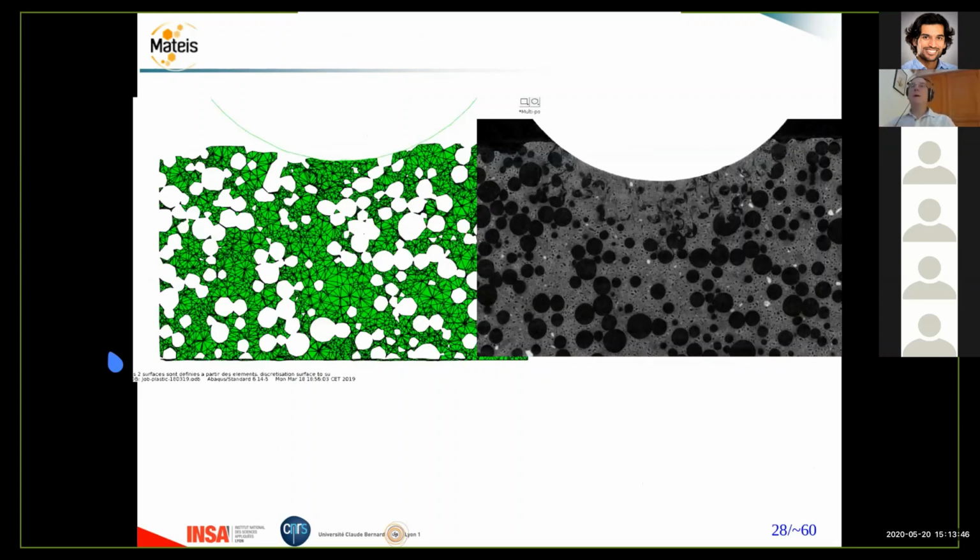As you can see here, the air bubbles are not meshed, so they are like air. But again, you have to remember that all this is porous. So the air bubbles cannot contain air that cannot flow away from the air bubble. So the air bubble is really like a complete void. Okay. With no mechanical properties.